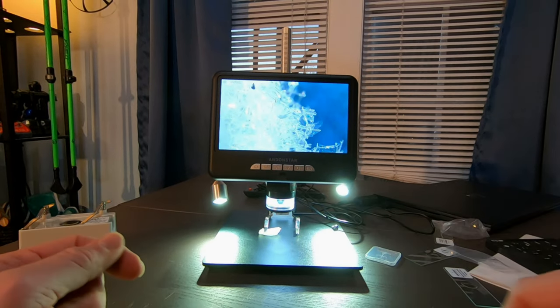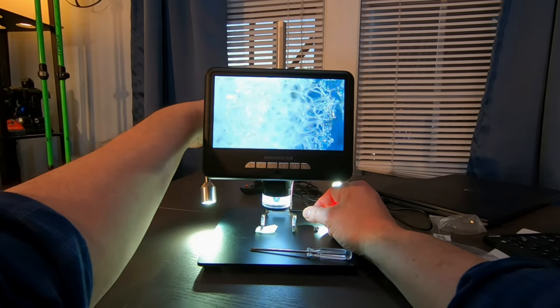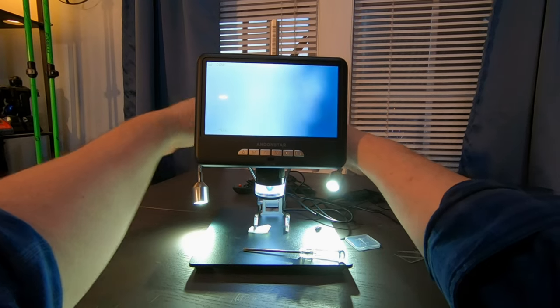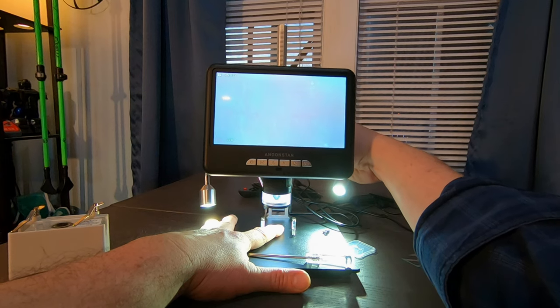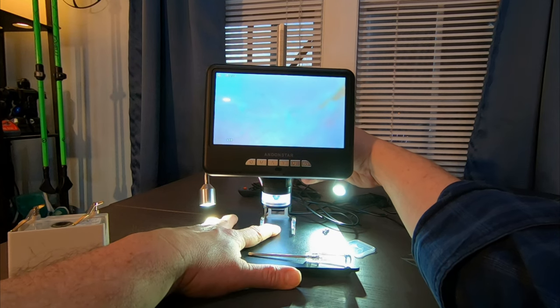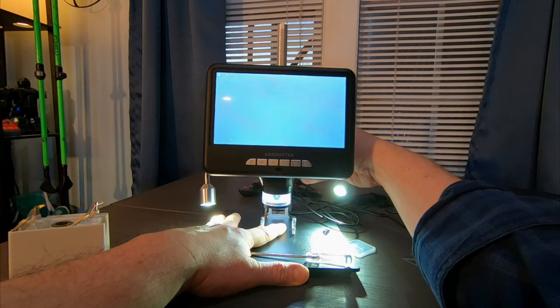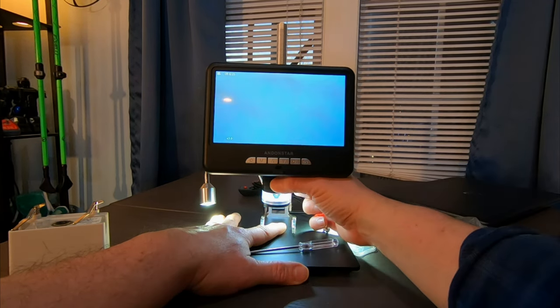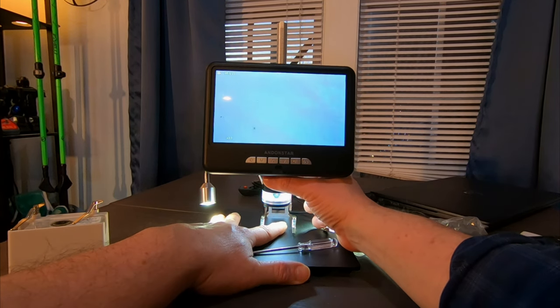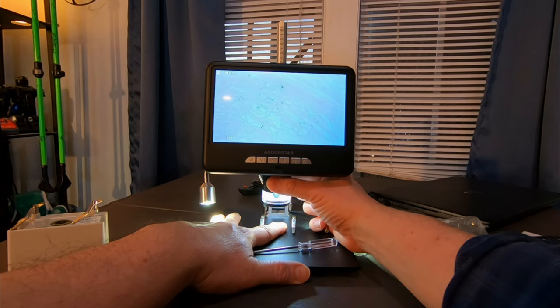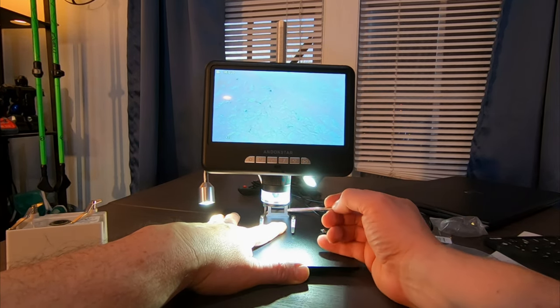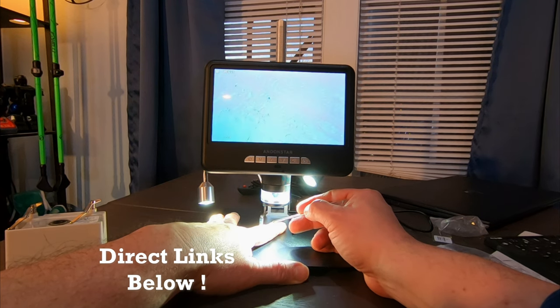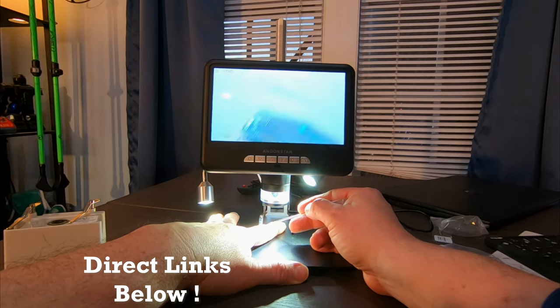Maybe someone got a piece of wood in their finger. And you need to get that wood out of the finger. You can have the person keep their finger still. And then you zoom in to that part of the finger. You know. Let's see. Let's go to a part that might not be that nice. Let's see. Oh, gross. Okay. But anyway. You get the idea, right? That's pretty disgusting. Okay. But look at that. Look at that. I can really zoom in my fingers. And show the kids. Hey, look. You see that? Look at it. That's. I don't know what that is. But in the world. Okay. This is scary guys and gals. Right? You're going to be looking at things and seeing things you don't know about yourself. But look at this. I can go in here and say, I got some important work. We got to get that out of there. We got to clean that. We got to clean it. There it is. So let's go ahead and clean this piece here. Can I get rid of it? Whatever that is on my skin.